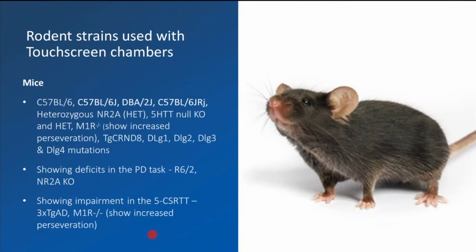Several strains of mice have also been used with the touchscreens, including transgenic and knockout mice. We will look at one of these strains' performance in the PAL task later.